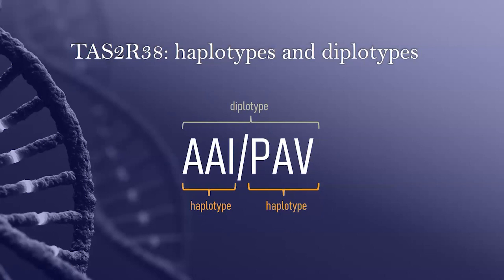What we can infer from looking at a diplotype is that the 2 most common haplotype forms are going to be PAV and AVI. So when we look at the diplotypes, we're usually going to see a combination of those 2. That tells us directly whether somebody is a het, a super taster, or a non-taster. But even though most people are homozygous or heterozygous for these 2 haplotypes, there is so much diversity in genetics, but especially in things like taste. As you can see from my diplotype in particular, there's actually much more complexity than AVI and PAV.